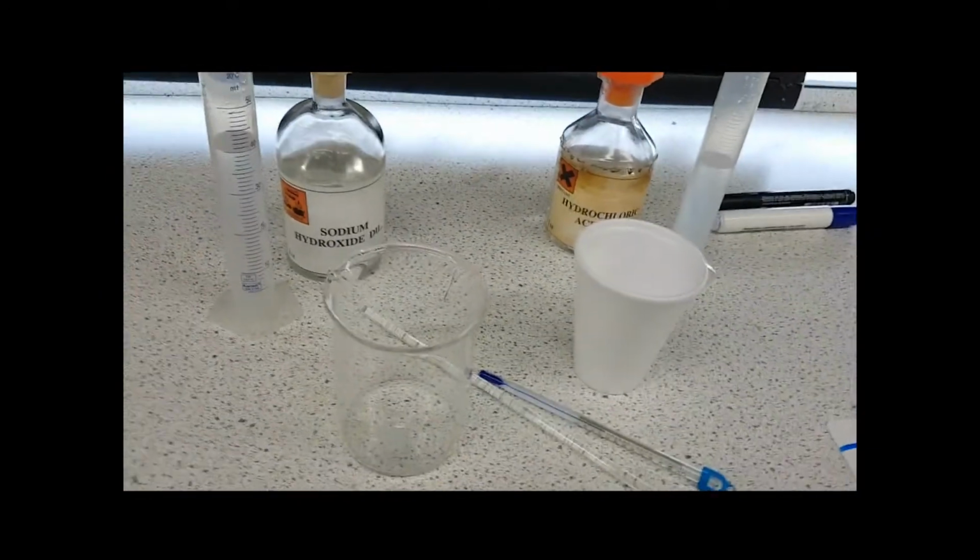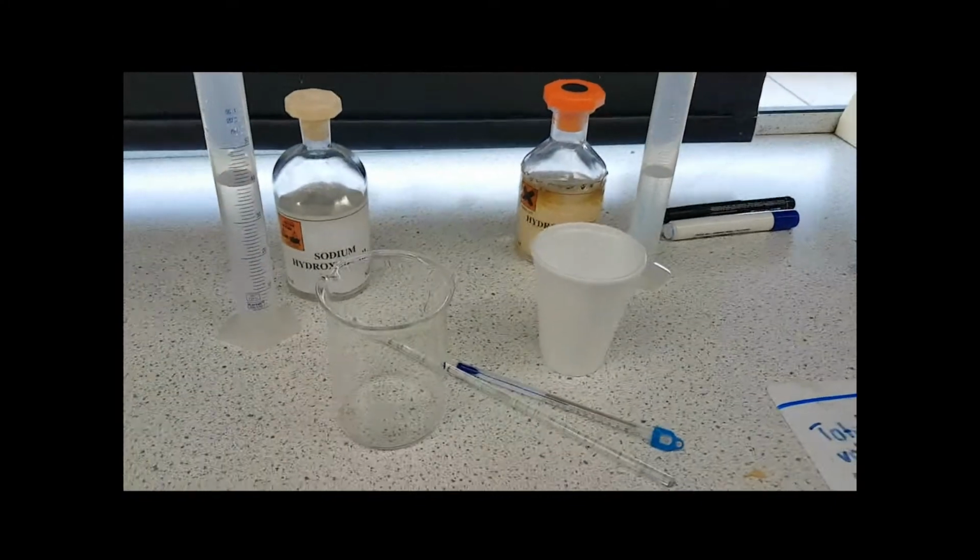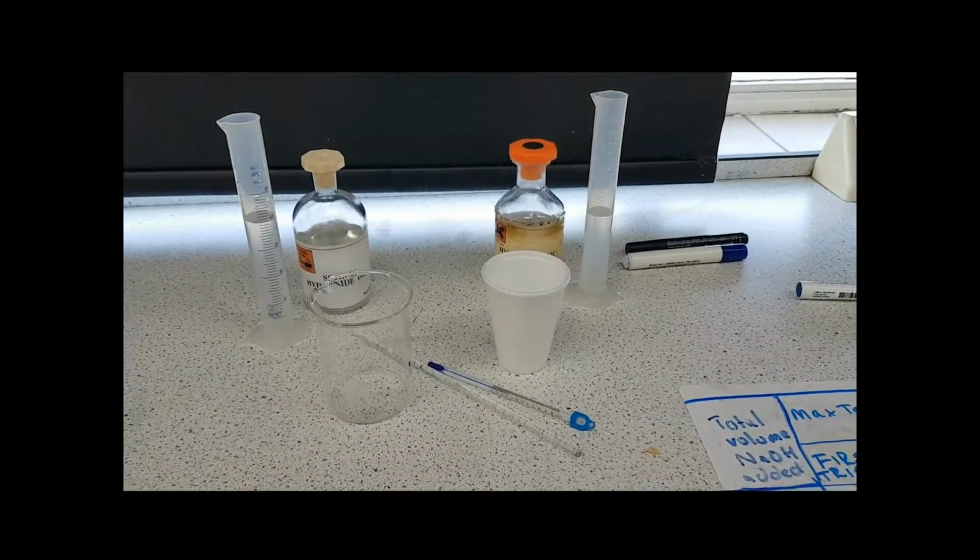This experiment is all about exo and endothermic reactions. This particular one in your book has been done by Mr.